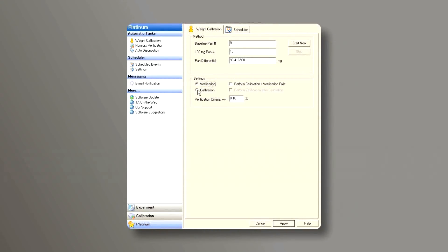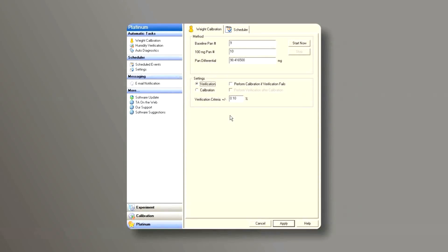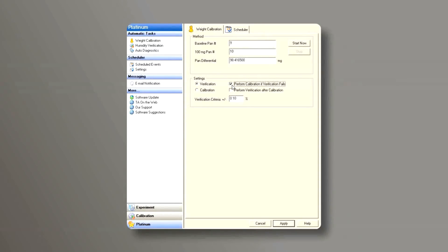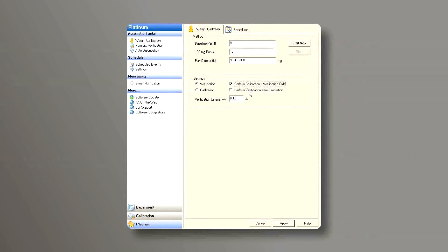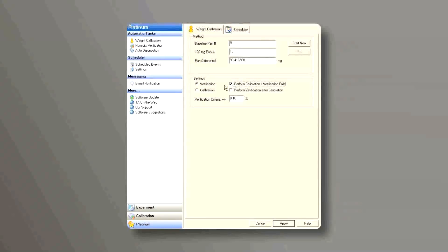We can either do a verification or a calibration. Verification is when we determine whether the current calibration is acceptable or not. You can click on the box that says perform a calibration if verification fails. That means if the verification doesn't fall within the verification criteria, it will automatically do a weight calibration.